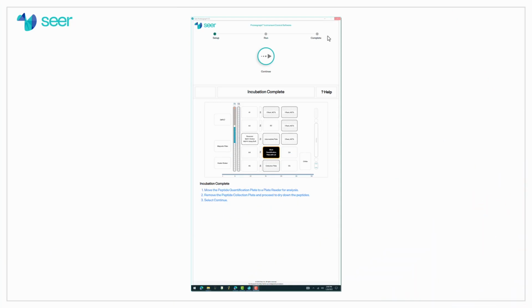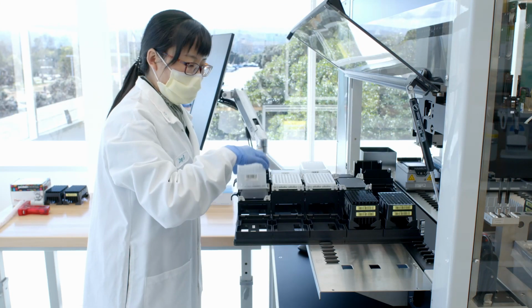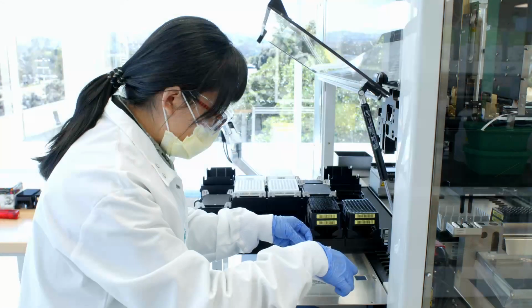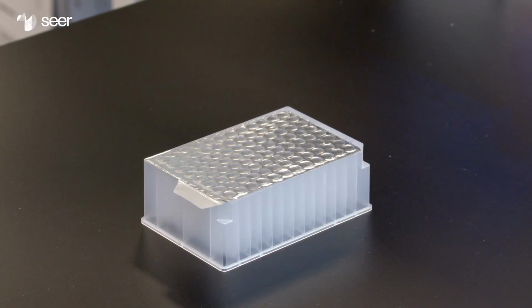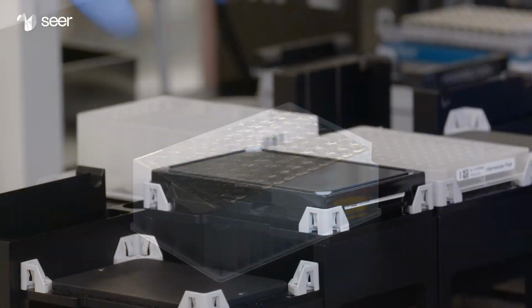Quantification method is complete. Now we'll remove the collection plate. At the incubation complete stage, open the front protective cover. Immediately remove the collection plate from the work deck. The plate contains the quantified peptides. Seal the collection plate with aluminum sealing foil. Set the collection plate aside at room temperature until you are ready to proceed with drying the peptides.